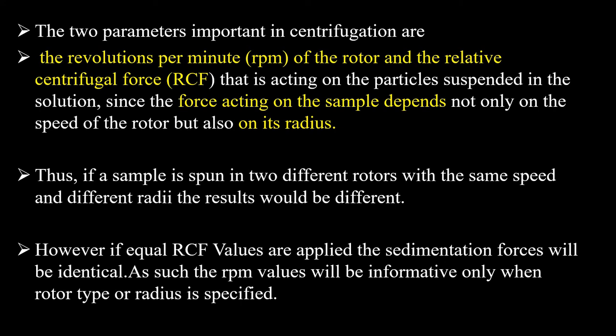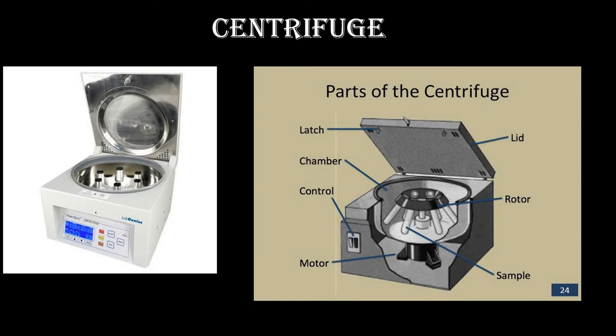However, if equal RCF values are applied, the sedimentation forces will be identical. As such, the RPM values will be informative only when rotor type or radius is specified.